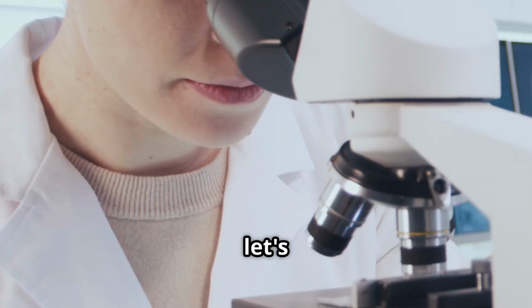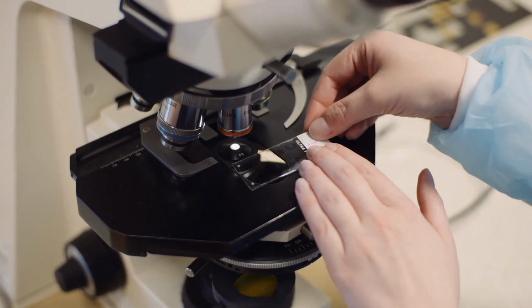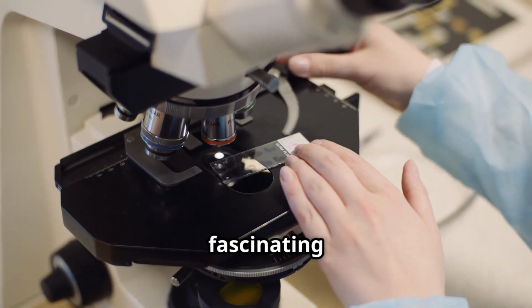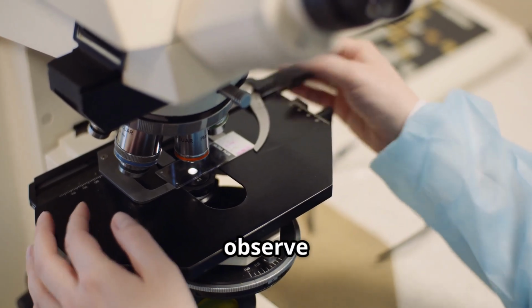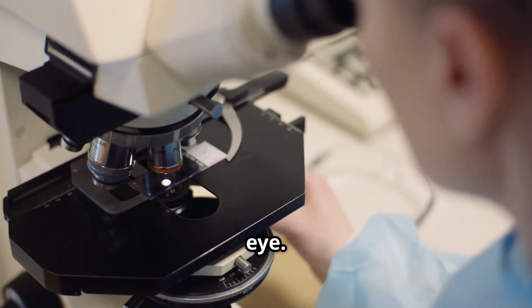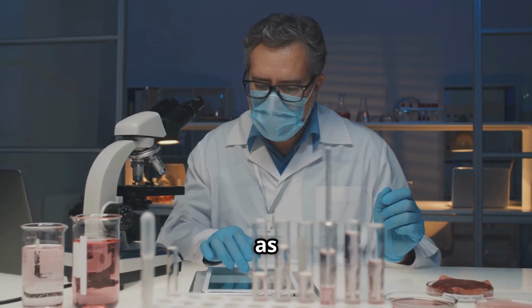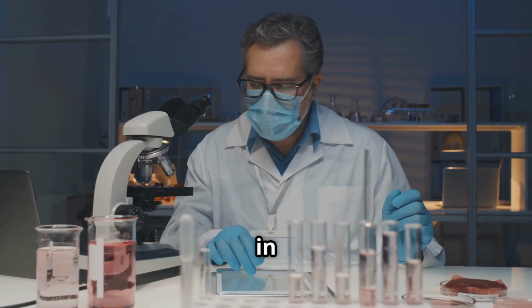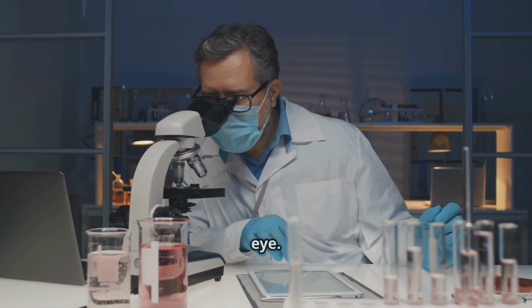Welcome back. Today let's discuss microscopy. Microscopy is a fascinating and essential field in science that allows us to observe objects that are too small to be seen by our naked eye. In cell biology, it is a vital tool as virtually everything we study in cell biology is far too small to see with our naked eye.